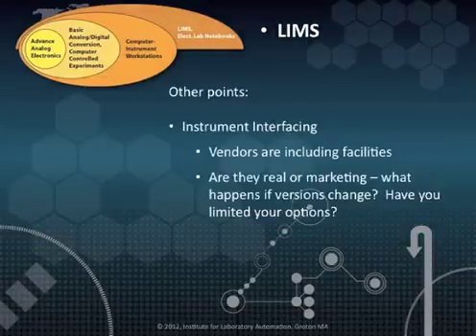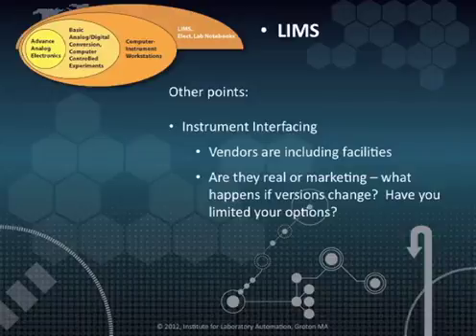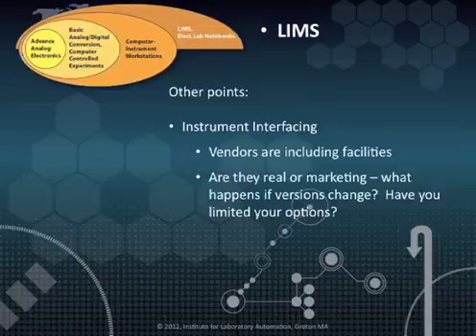Improvements in laboratory workflow could happen if laboratory instruments send data directly to the LIMS. This is a fairly common requirement, and a number of vendors have included these capabilities in their systems. Often the capabilities are limited to instruments from specific vendors or possibly particular models of equipment. Going beyond the capabilities that are provided by the vendors can be an expensive undertaking, and doing so can jeopardize the project. If this is key to your product requirements, make sure you carefully consider what has to be done and your ability to carry it out.